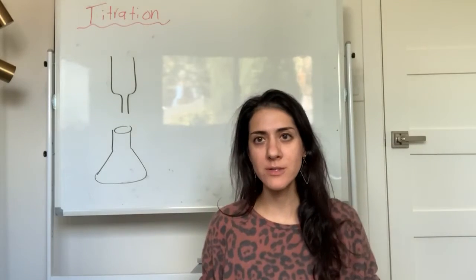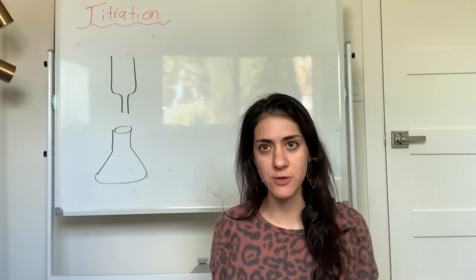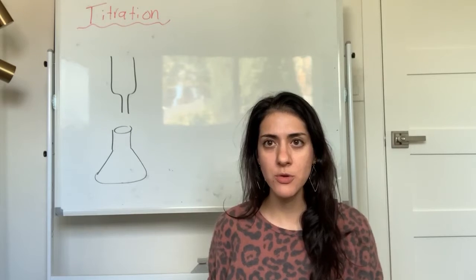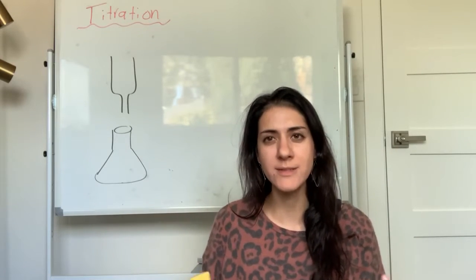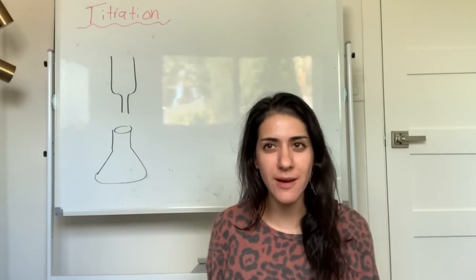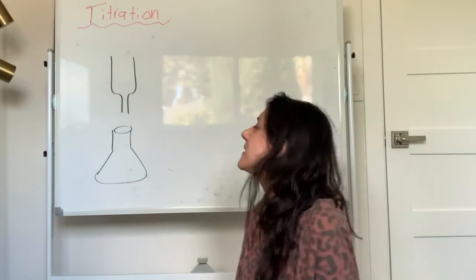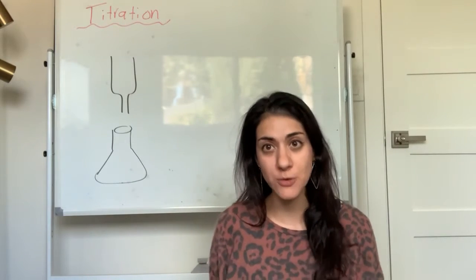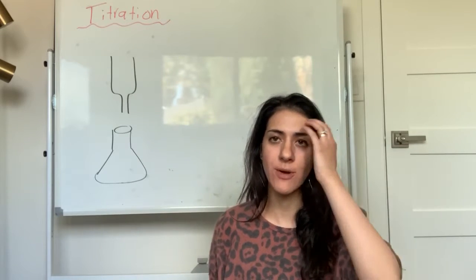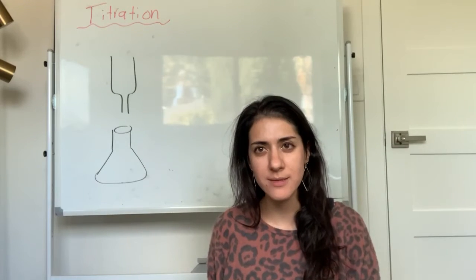So what you are going to do virtually this week, you're going to do titration. Now, before you watch the video on titration, I wanted to quickly go over the concept of what is titration and why you have to care about it. So titration is a technique to figure out how much acid or base you have. Now, why do you have to care about that?